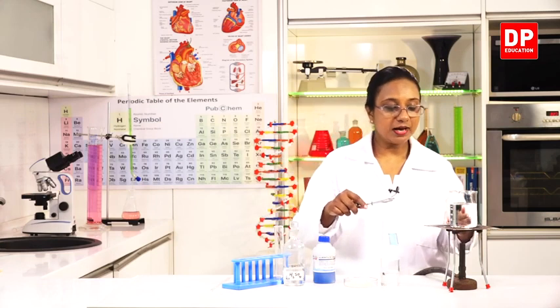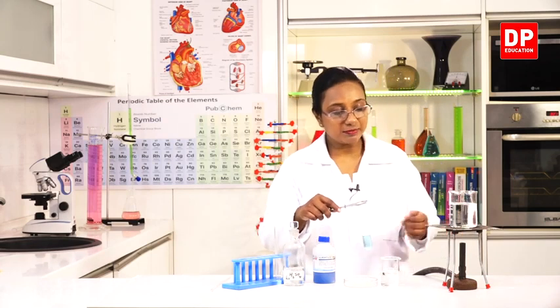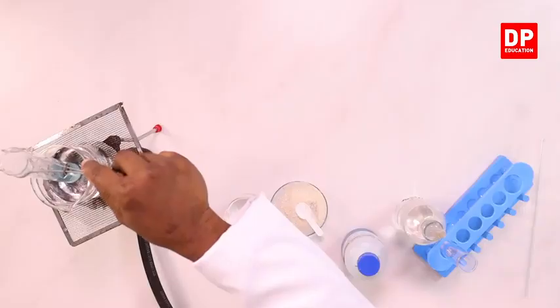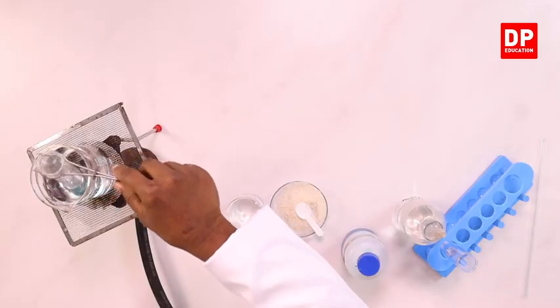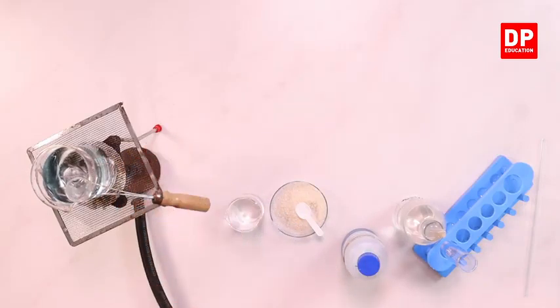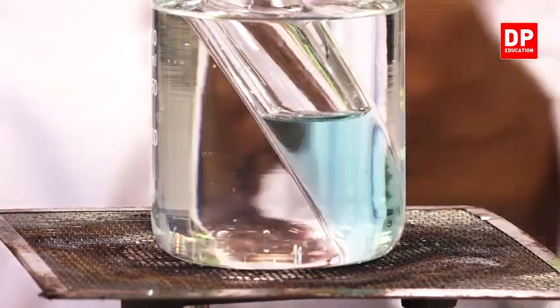So for a water bath, we use a beaker containing water. I have already got it ready, and you can see the burner as well as the tripod and the wire mesh. I will place the mixture into the beaker. You can observe the color change. We will have to wait for a little time.